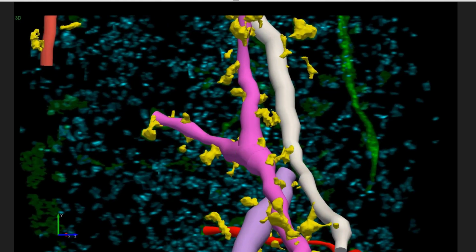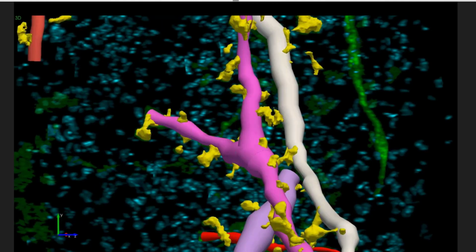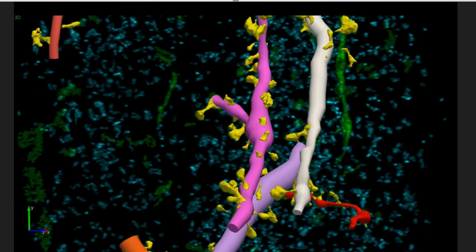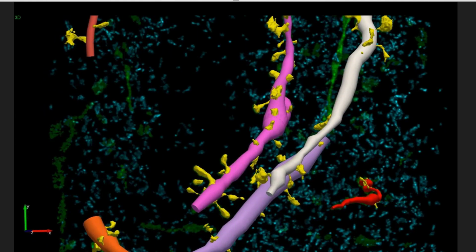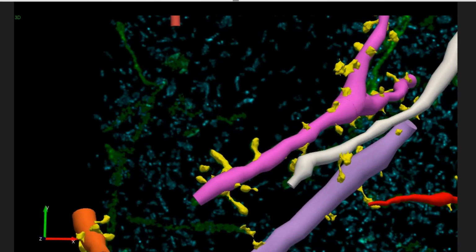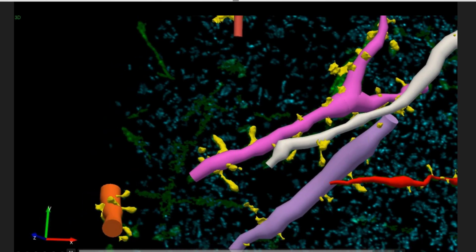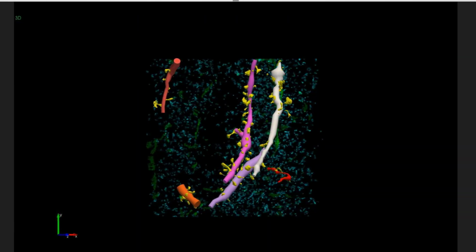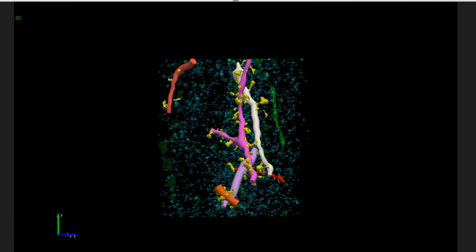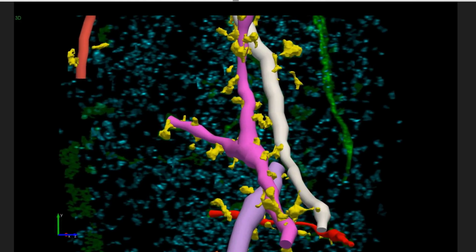Oh, one thing to mention here is that we can change the displayed scaling. So if you do bring something like this in, or an image where the scaling is slightly off, we can alter the scaling within the program, and then we can revert it back afterward. And that's something that we had to do here. Please feel free to email me and ask with more detail. I apologize, I'm running short on time, and I can't get into the nitty-gritty of that, but that is an available feature within the program.